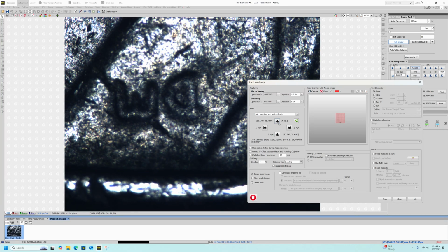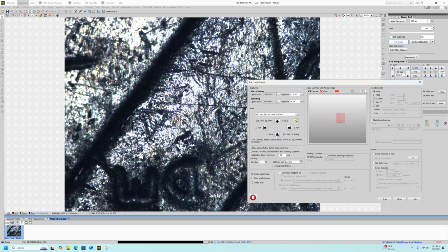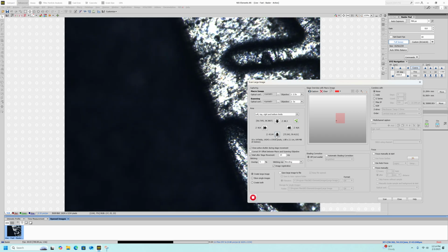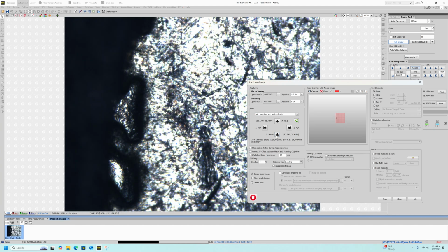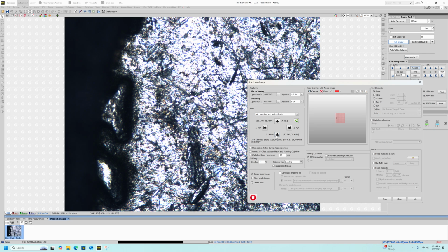I'm stitching a United States nickel, and I have it fixtured. This is on an inverted microscope. So I've created positions on the north and south, or top and bottom areas of my sample. Now I'm over in the western portion, or the left side of my sample.